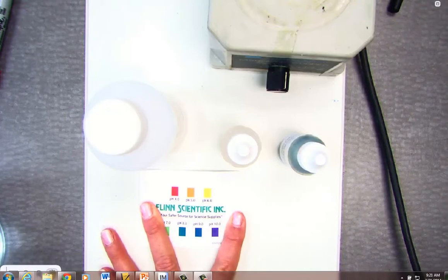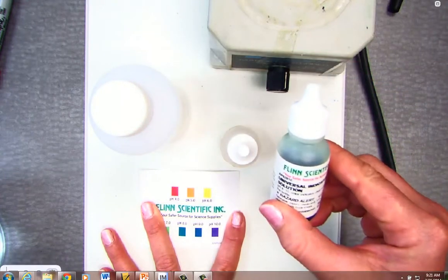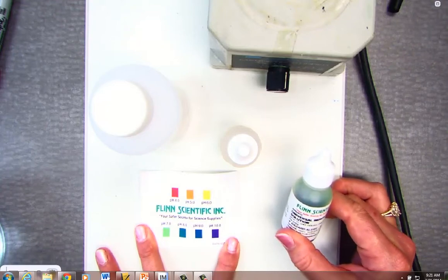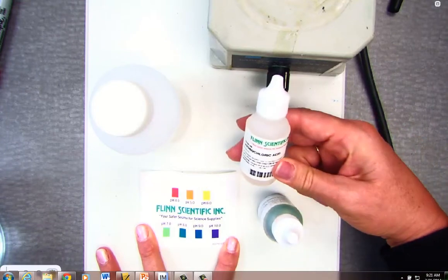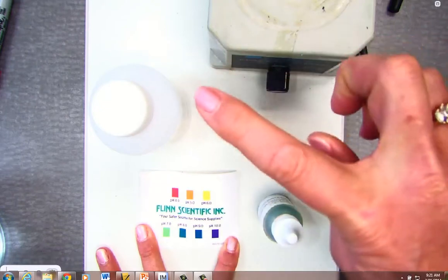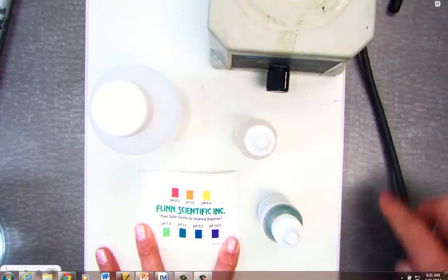Today we are modeling Le Chatelier's principle using some milk of magnesia. I have a universal indicator — that's why you see the rainbow here — giving us an indication of how acidic or how basic our solution will be. We also have some hydrochloric acid, which is the same as what's in our stomach. So we're going to be modeling how Le Chatelier's principle will be used in this milk of magnesia and hydrochloric acid demonstration.